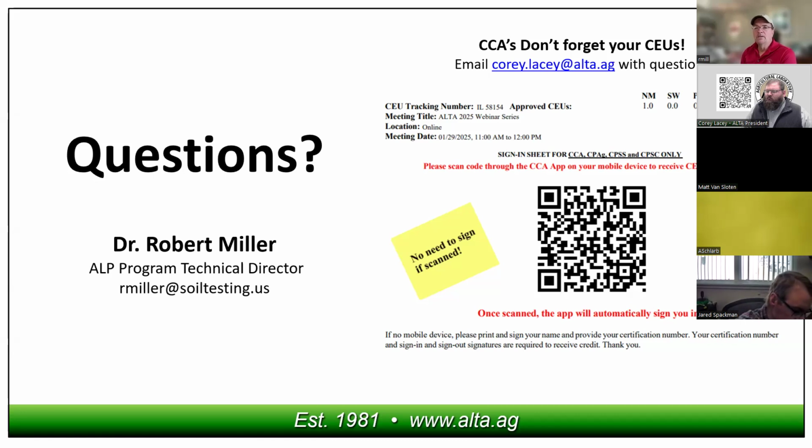And what I mean by that is the salinity, the EC of the solution when you mix the water with the soil before you measure pH, is greatly impacted by how much salt is in that solution. Case in point, we published a paper on this in SSAJ in 2010 with David Kissel. Basically, it says if I've got a low EC soil versus a high EC soil, you can get radically different pHs. The case was a salt pH versus a water pH on a sandy loam out of O'Neill, Nebraska, and the pH difference between the two methods was 1.4 units.